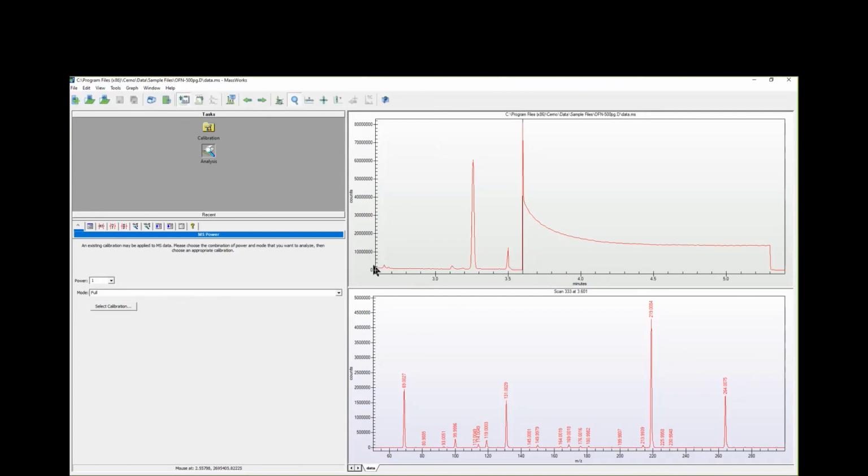So what you can see here is that's the OFN 1 microliter injection, eluting here at about 3.25 or so minutes. And then at the end of the run, you see the calibration gas was turned on. This was turned on much longer than you needed. This was actually something that was done a very long time ago. Generally, you only need about 30 seconds of the gas.